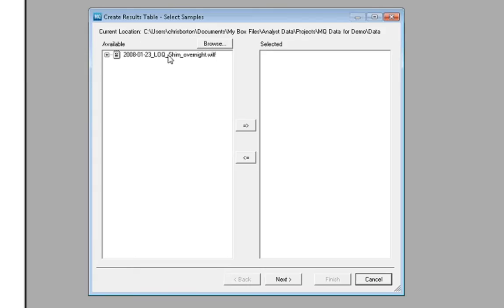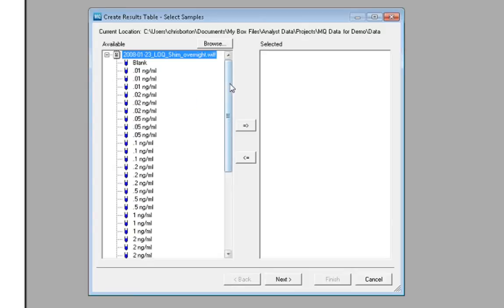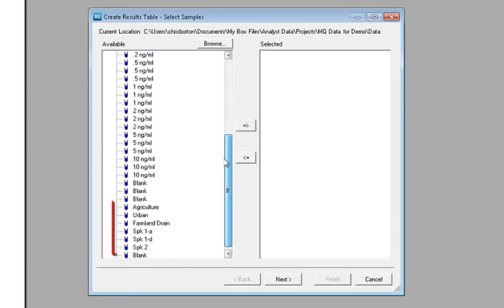In this dataset, we have triplicate injections of calibration standards, multiple blank injections, then injections of a few water samples, including agriculture, urban, and farmland-drained water samples that we are screening for pharmaceuticals and personal care products and some assorted pesticides and antibiotics.